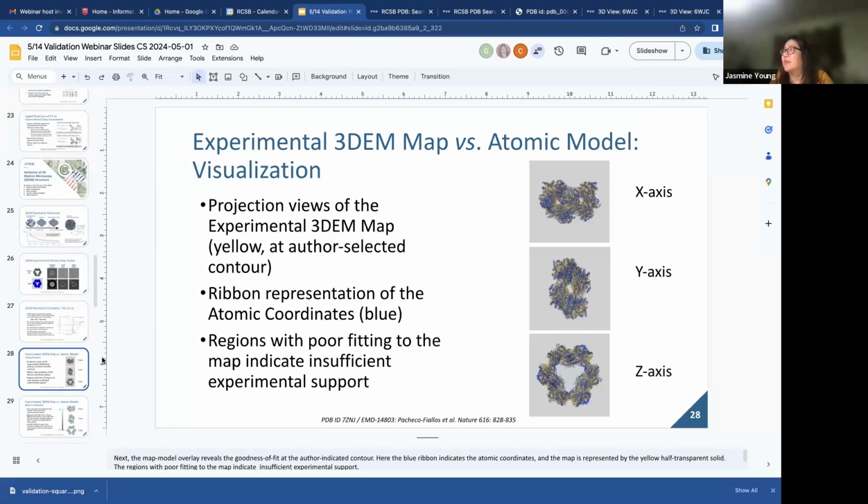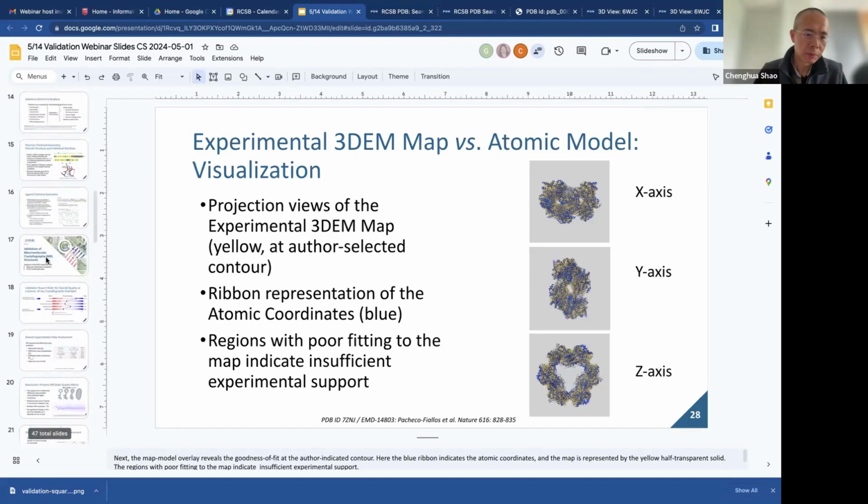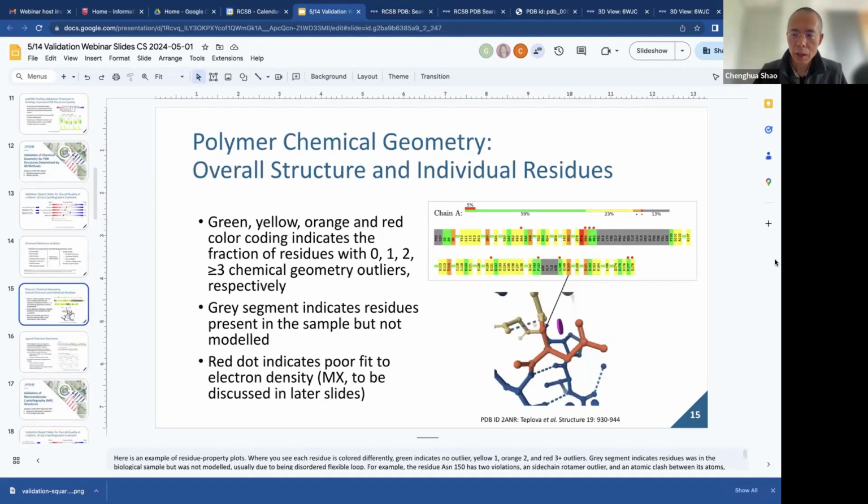Thank you. And Egan has clarified he didn't mean the unmodeled region. Oh yeah, I'll go back. You mean a region like this, right? Short answer is we cannot verify. If it's a model, how do we verify? In that sense, we do have tools that can help you if you are interested in the potential structures of that gap region, if I understand it correctly.